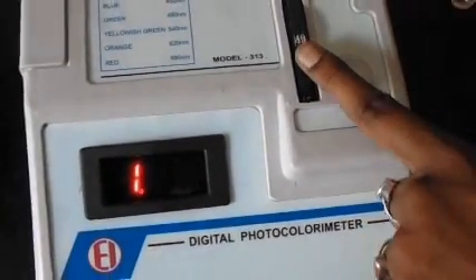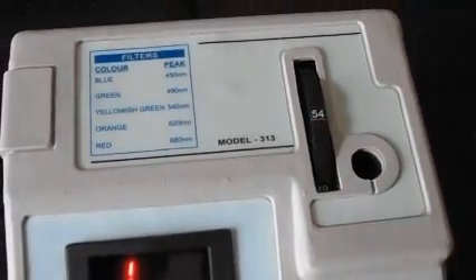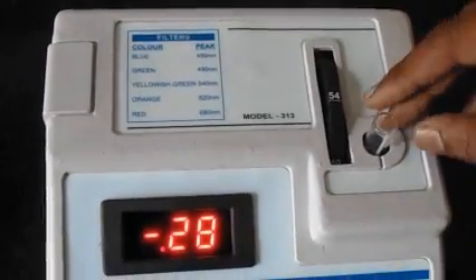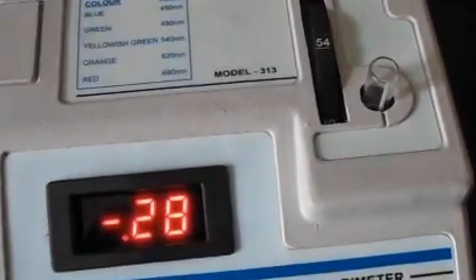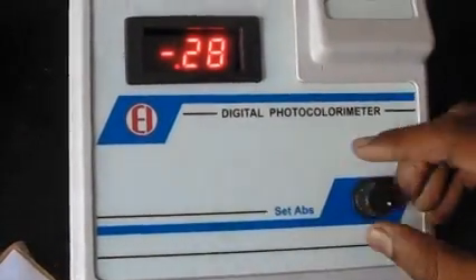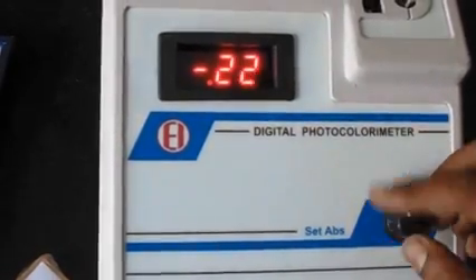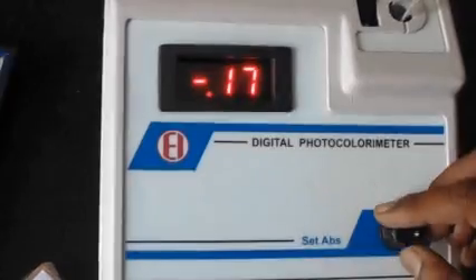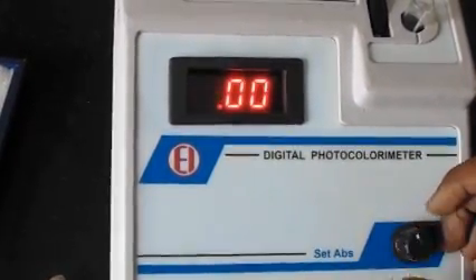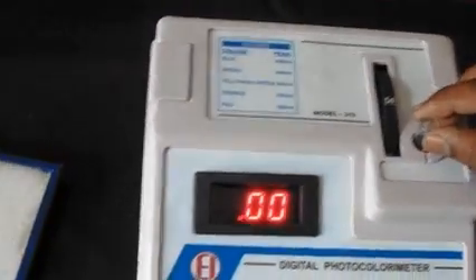First, select the filter at the wavelength you want to test the sample. Let's suppose we select 550nm. Insert the test tube with distilled water and set the display value to 0 by rotating the knob. Wait until it comes to 0. Now, distilled water is set to 0 — we have set the OD to 0.